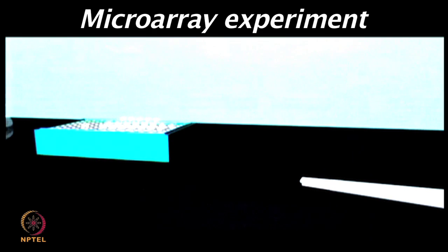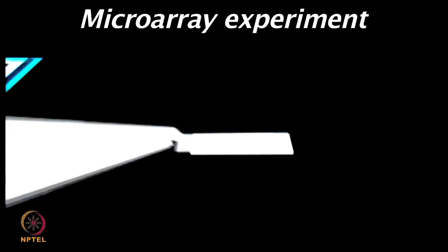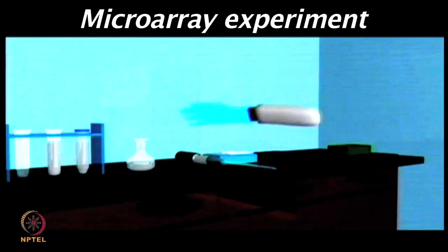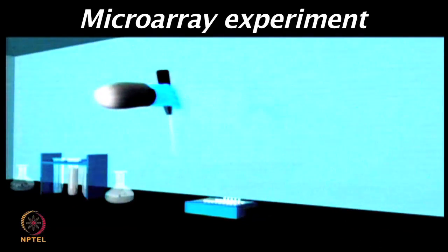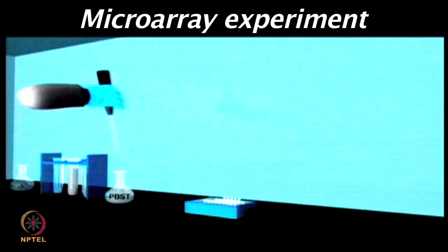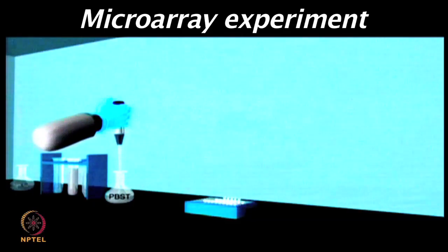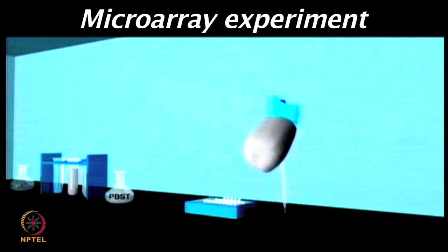So, once the primary antibody or the serum is placed on the chip surface, then one needs to incubate for at least an hour. And again, different scientists try different types of approaches. A few people prefer using overnight incubation at 4 degrees, and some groups prefer using 1 hour at room temperature. There are different schools of thought here.